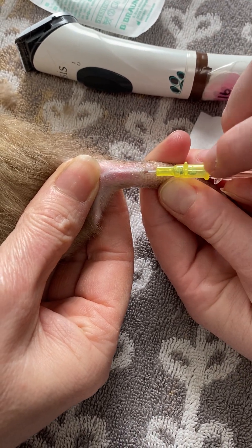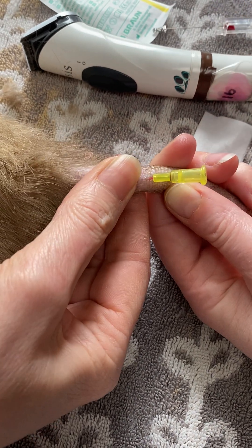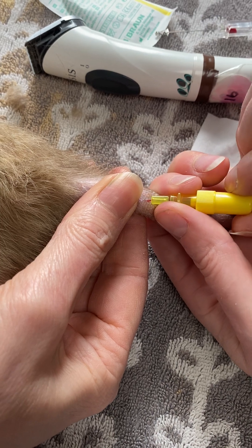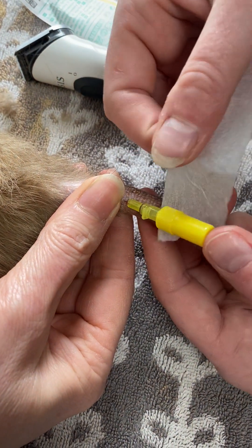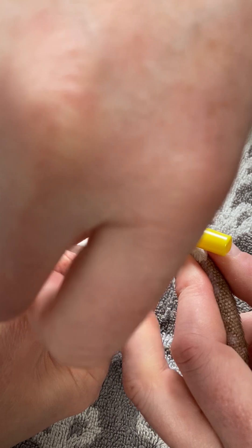Then we just gently pop that IV cannula in place. There we go, all done. We're going to attach a bung and then just a very small amount of tape underneath to secure that in place.